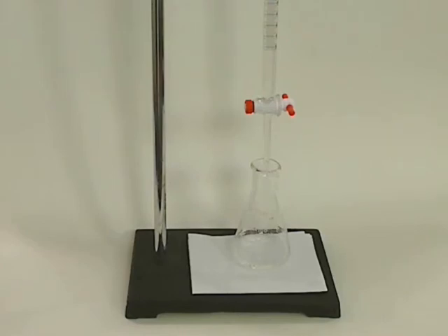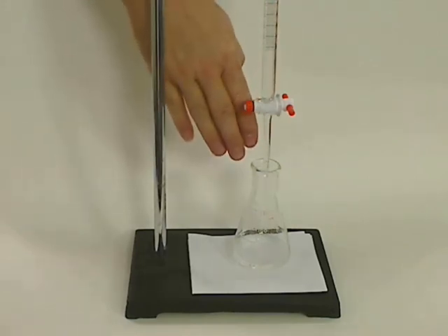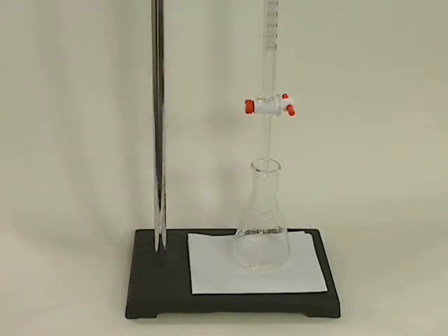Also remember, when you're doing a titration, you don't have to start at zero. You can start at any number and then you're going to have a starting volume and a finishing volume. The difference is going to be the amount that goes into your Erlenmeyer flask and reacts during the titration.